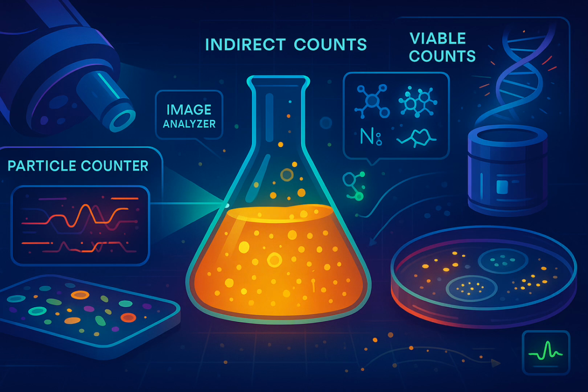Okay. We mentioned microscopy with stains for yeast viability earlier. Methylene blue, are there others? Yes, viability or vital stains used with microscopy. These dyes react differently with living versus dead cells, usually based on membrane integrity or enzyme activity. Examples. Fluorescent stains are powerful here. You need a fluorescence microscope. A common combo is carboxyfluorescein diacetate, or CFDA. Living cells take it up, enzymes inside convert it to a green fluorescent molecule that gets trapped inside. So living cells glow green.